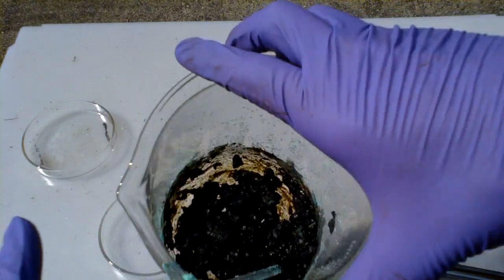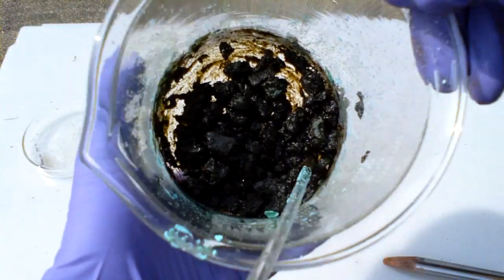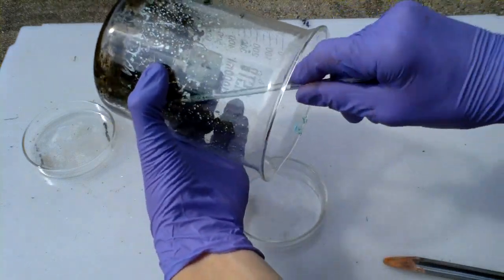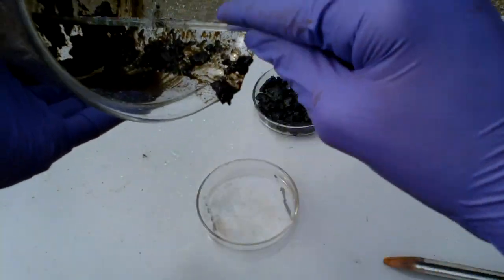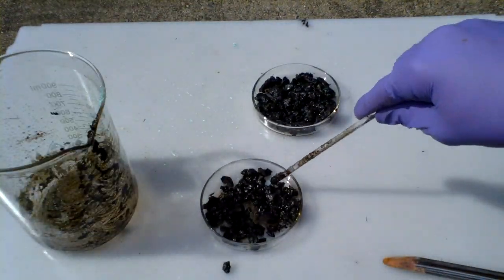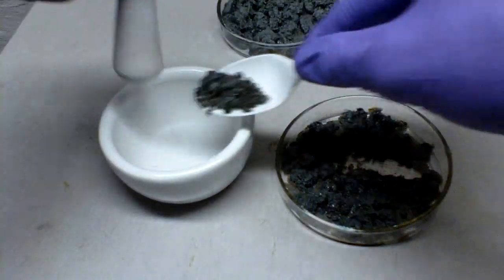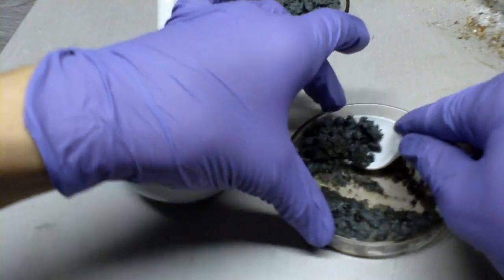I have finished boiling the copper chloride solution, and as you can see, I have a whole bunch of crystals left in the bottom of the beaker. Since the crystals are still wet, I am going to put them in some petri dishes and leave them in the sun to dry. I realized that the copper chloride would not dry evenly with it being in such large clumps, so I am now going to grind it in my mortar and pestle to try to reduce the clumpiness of it.